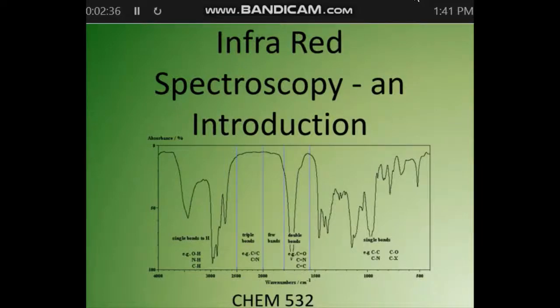In this video, we'll learn about IR spectroscopy. We'll study the basics and we'll see how the spectroscopy works. Towards the end of the video, we will learn how to interpret the IR spectra.